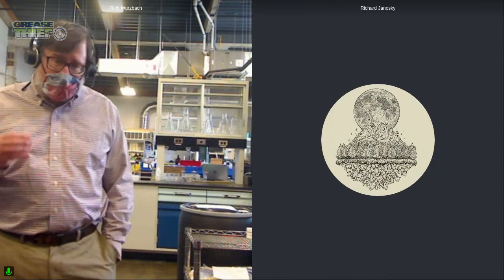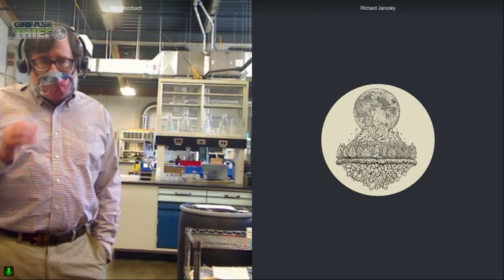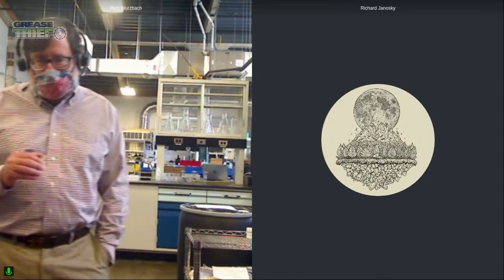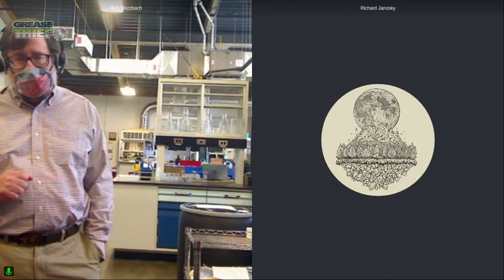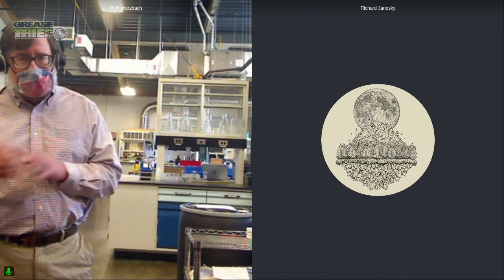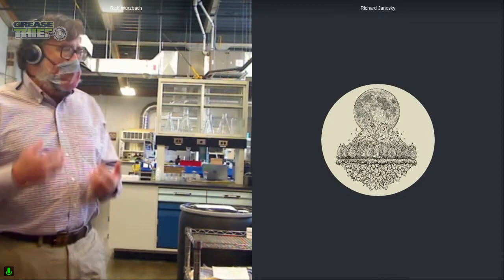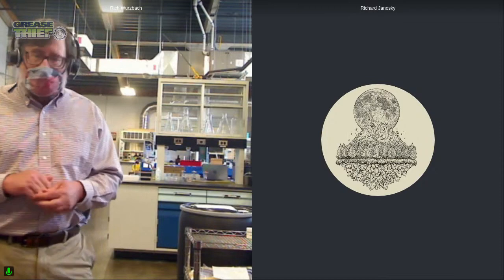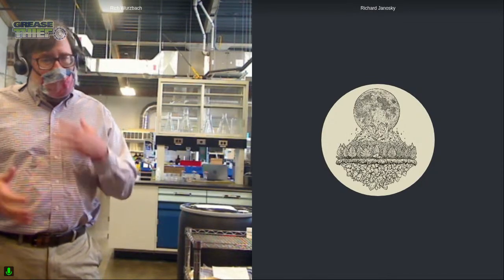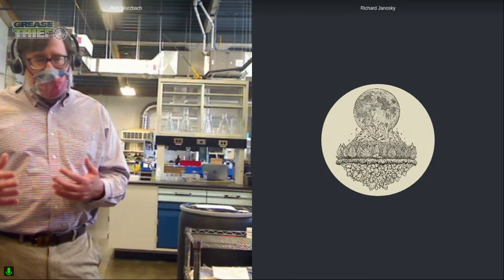And therefore, periodic rebaselining using the newer batches that a customer is getting is a really important thing. When we see some sudden and unexpected change, a lot of times that's where we'll circle back and say, hey, could you send us the grease tubes you're using now? Let us rebaseline that. Let's see how that formulation is. Because aside from that, there isn't any real way to compensate or offset for those changes.